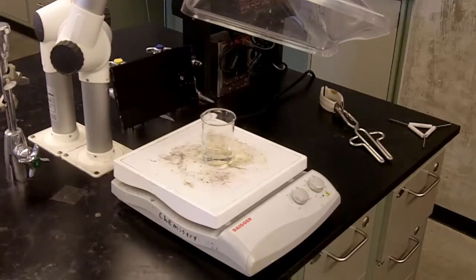Now that our hydrochloric acid has heated up some, we're going to go ahead and add the zinc to it. So we'll drop in a couple pieces of zinc, and if you look closely, you can see the bubbles starting to rise off of the zinc, and that is that chemical reaction occurring. So those bubbles are the hydrogen gas being released, and at the same time that occurs, the zinc is reacting with the chlorine in the solution and actually forming our zinc chloride. So those bubbles are your sign of a chemical reaction occurring.